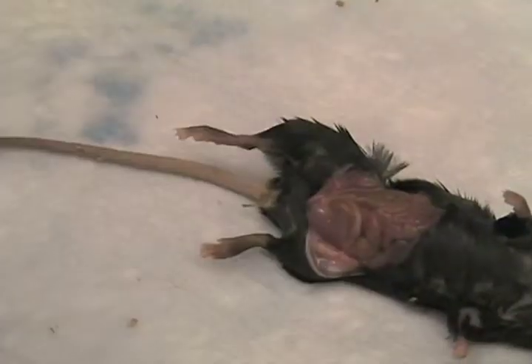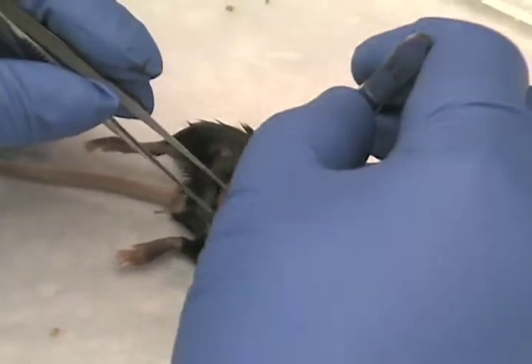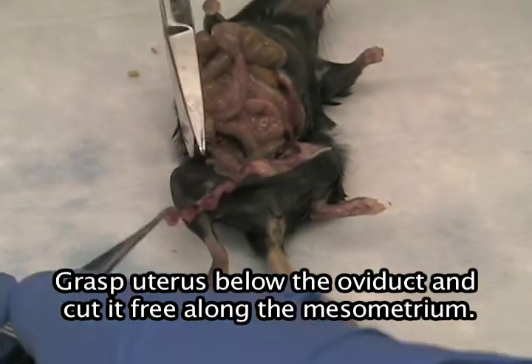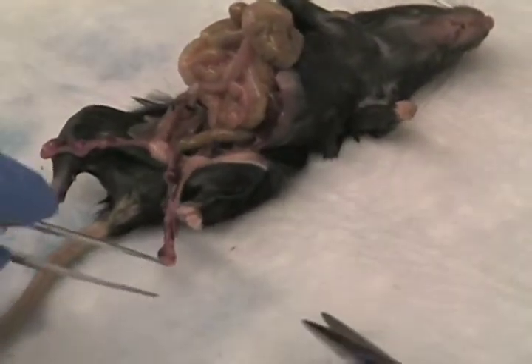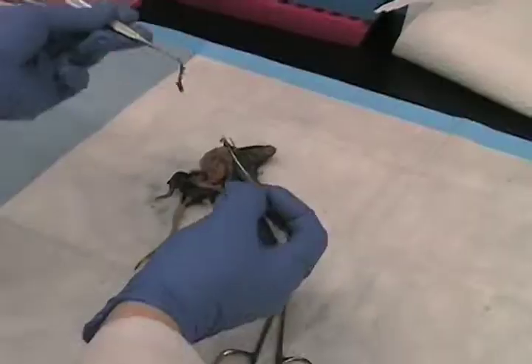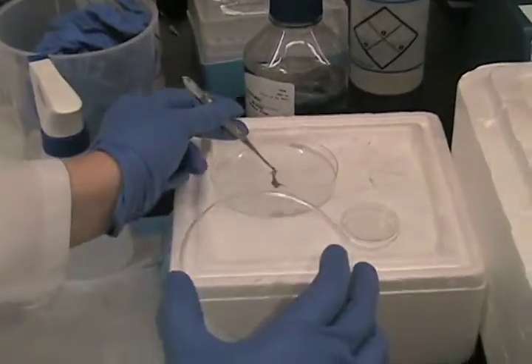Just flap that back. You want to cut along the mesometrium of the animal and pull apart both uterine horns, which are connected at the middle. You can cut right at the base. You're going to probably get a lot of fat along with it. You can take the entire uterine horn of the animal and just place it right into the PBS.